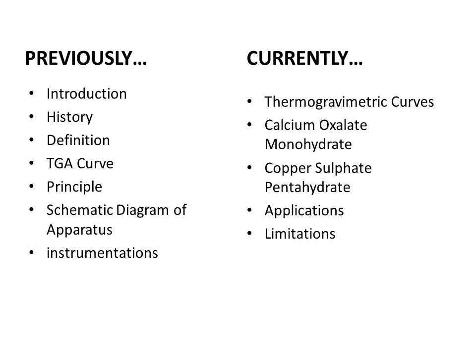Dear students, if you didn't watch the first two parts about thermogravimetry, then you must watch them first, because we have discussed there the basic introduction of thermogravimetry. We have seen the history, then the definition of thermogravimetry, then a brief discussion on the thermogravimetric curve, then the principle of TGA, then a schematic diagram of the apparatus, and then we have discussed a complete instrumentation of TGA.